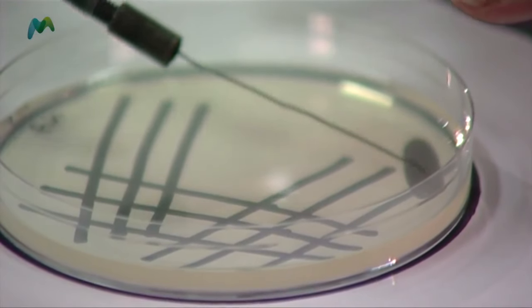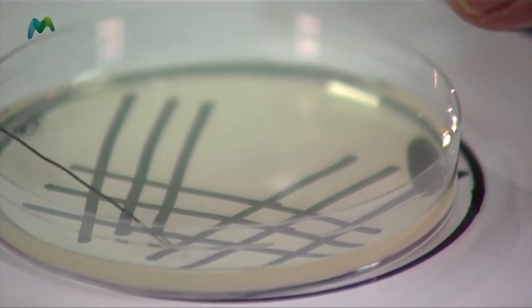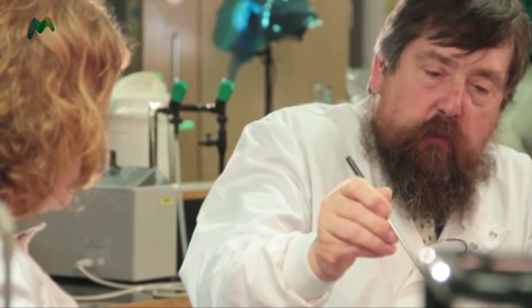I sterilize the loop just as before, running it through from the shaft end first and ending with the loop. I wait for it to cool, keeping my hand quite low on the bench and relaxed, then gently lift the lid. I draw the loop through the initial well and go across — one, two, three lines. When I finish, I sterilize the loop.